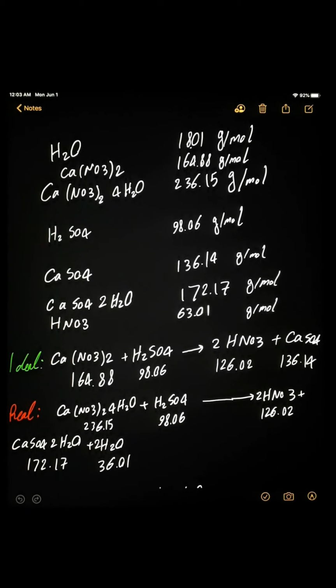To be precise, nitric acid over 67% is an absolutely controlled substance and you're not even allowed to own it. Below 67% you are allowed to have it, but you cannot find a place to purchase it from. So there is no other way but to make some at home.